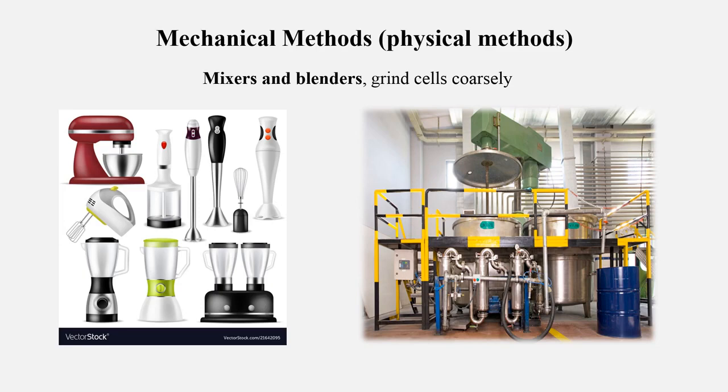مثل ما نلاحظ الصورة على اليسار تحتوي على مجموعة مختلفة من الخلاطات التي تستخدم لخلط وتحطيم الأنسجة النباتية والحيوانية، وتستخدم لإنتاجية بكميات قليلة أو small scale production. بينما الصورة على اليمين وتمثل خلاط عملاق يستخدم في المجال الصناعي، وذلك لغرض large scale production.